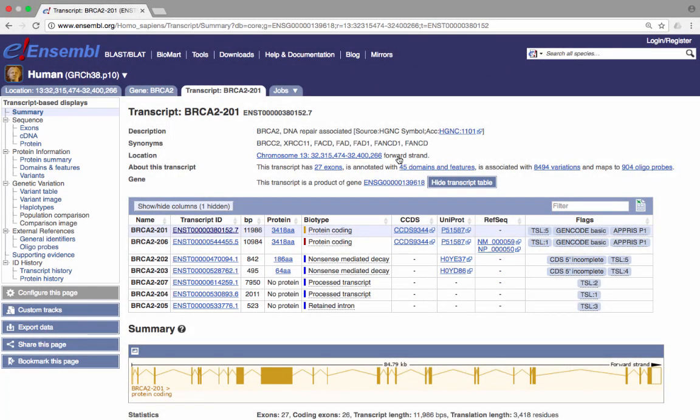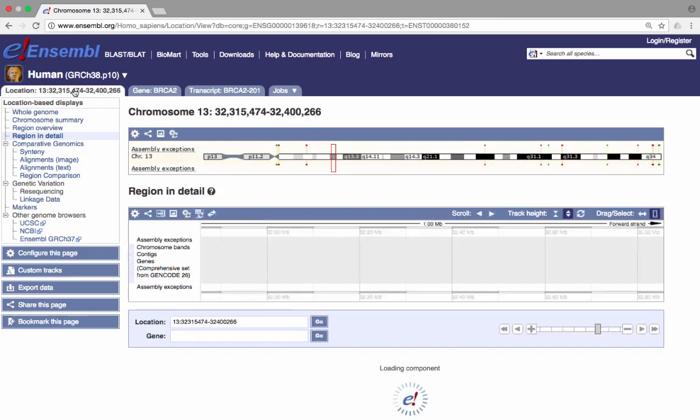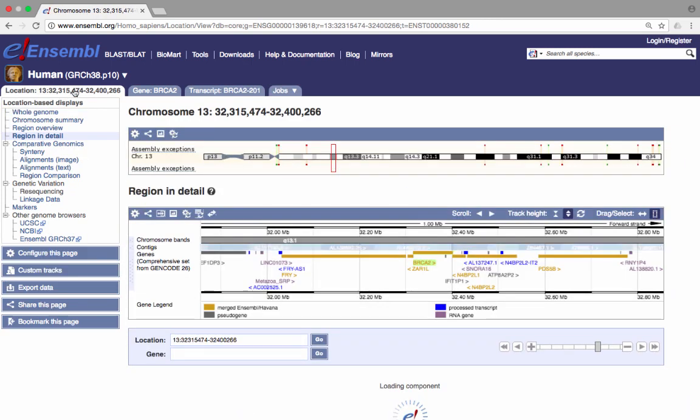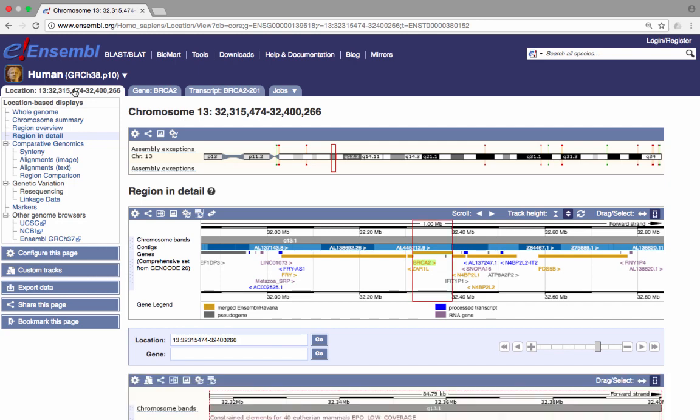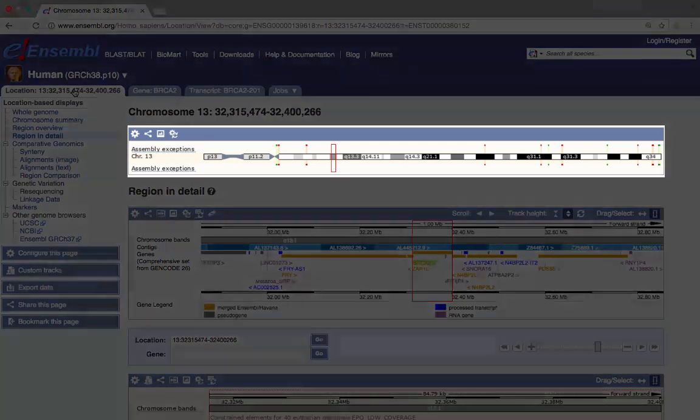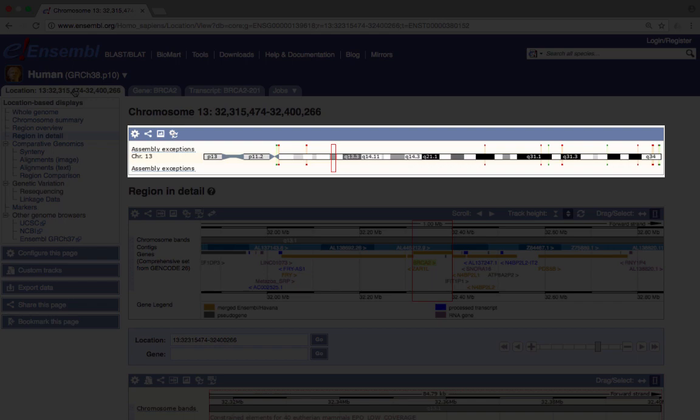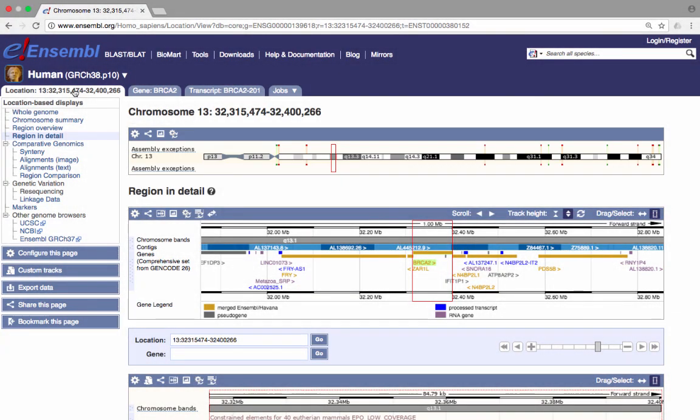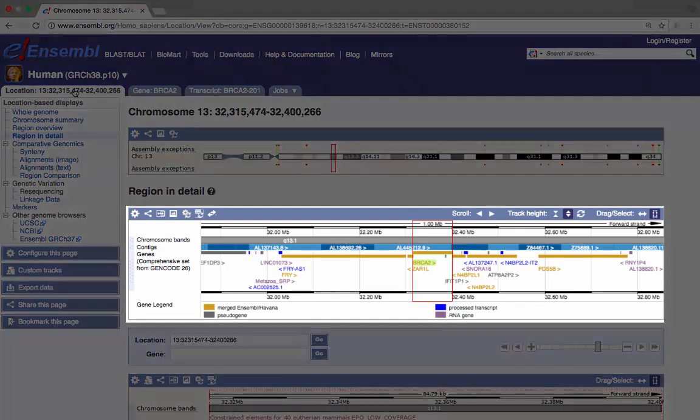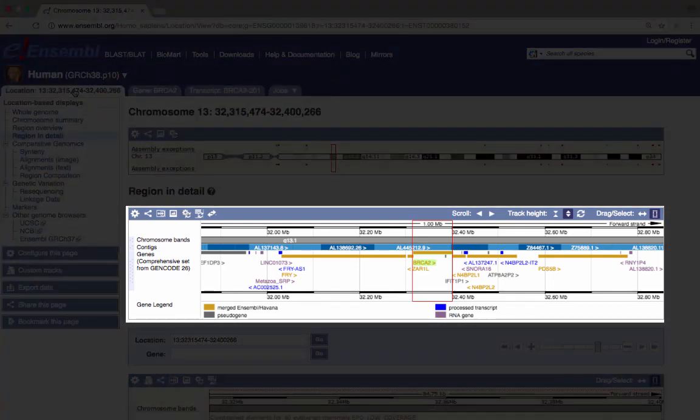Let's now look at a larger region of the genome surrounding the BRCA2 gene. Click on the location tab in the blue bar at the top to go to the region in detail page. At the top of this page is a chromosomal overview, and a red box depicts the region of the chromosome that the subsequent views on this page focus upon. The next image is a 1 megabase overview, where the BRCA2 gene is highlighted in a red box. Neighbouring genes are shown along the chromosome.